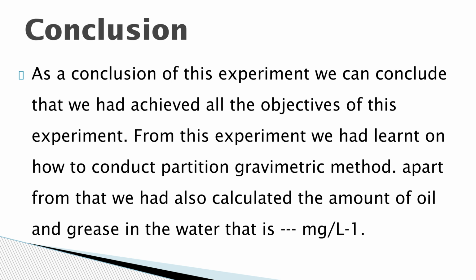In conclusion, this experiment successfully achieved its objectives. We learned how to perform the partition gravimetric method and calculated the amount of oil and grease in the water, expressed in milligram per liter.